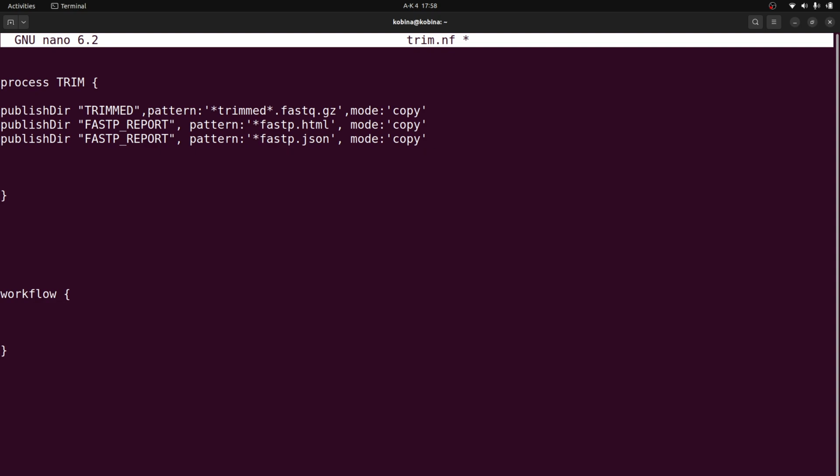So just make sure everything is correct here. We need to make sure everything is fine. Okay, so just make sure it's working fine for you, then we can proceed. Okay, so that is done. I want us to go back to the script and then just look at something here.